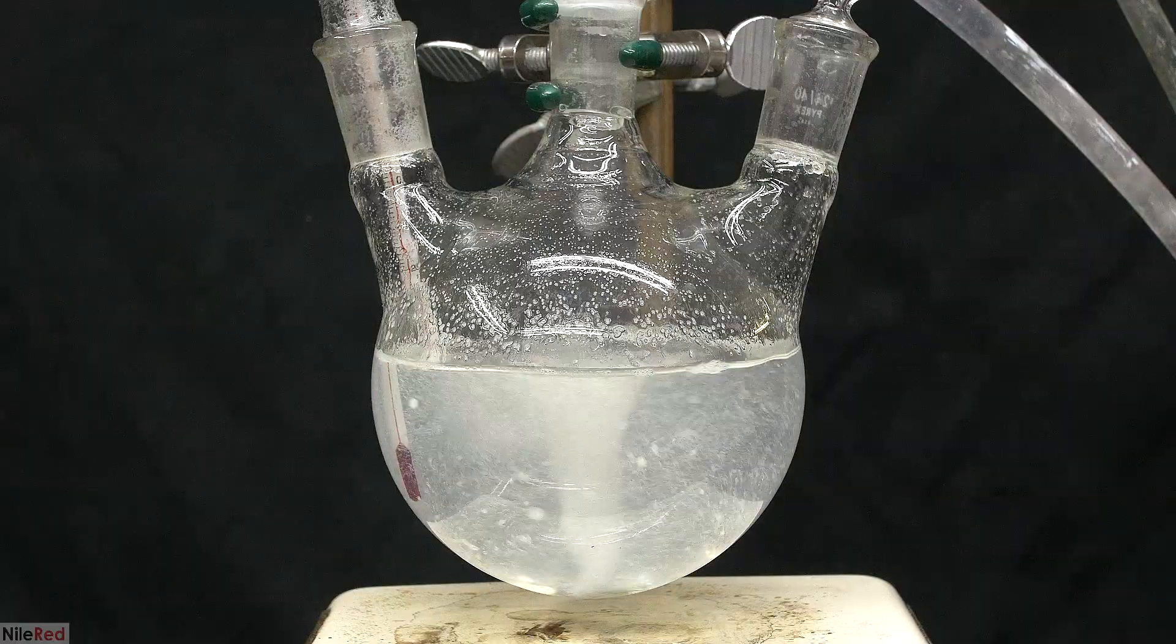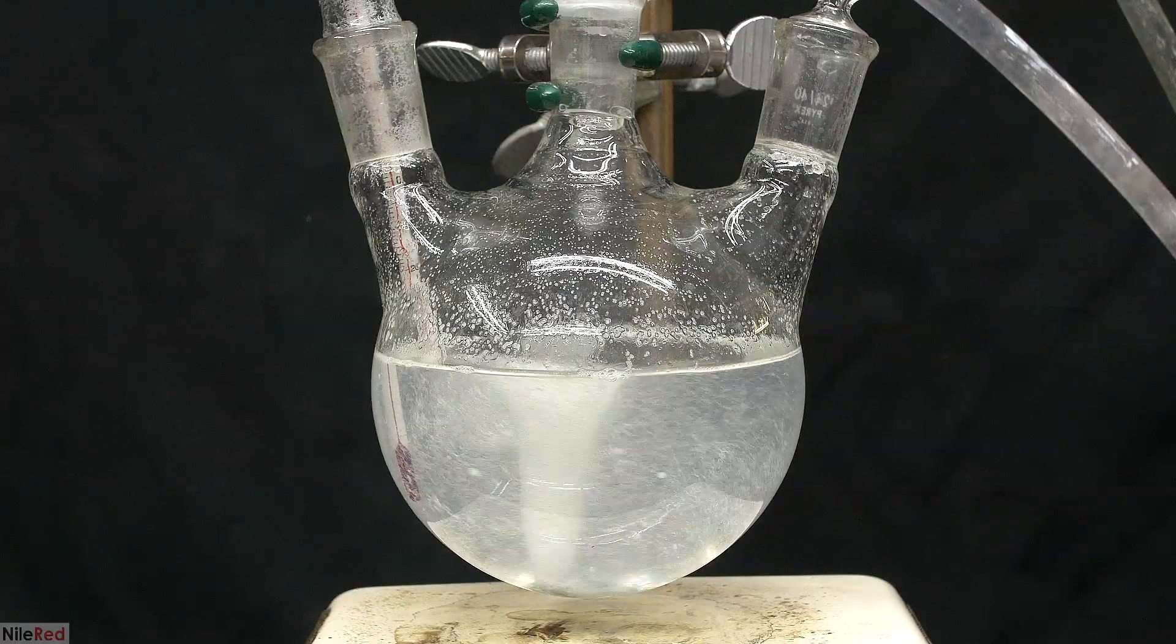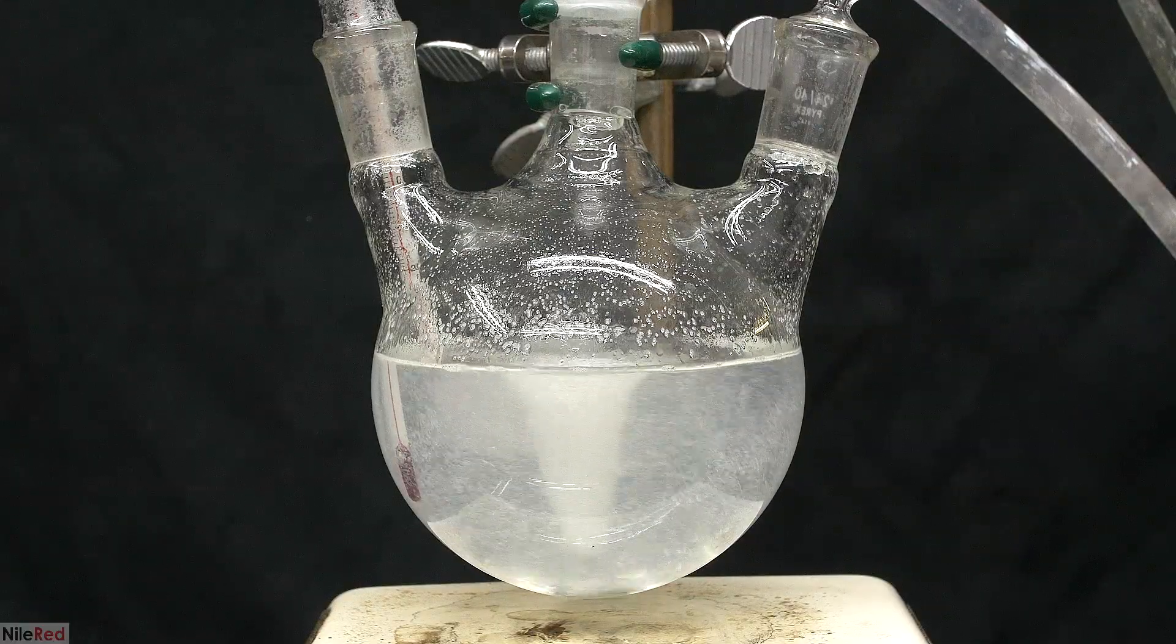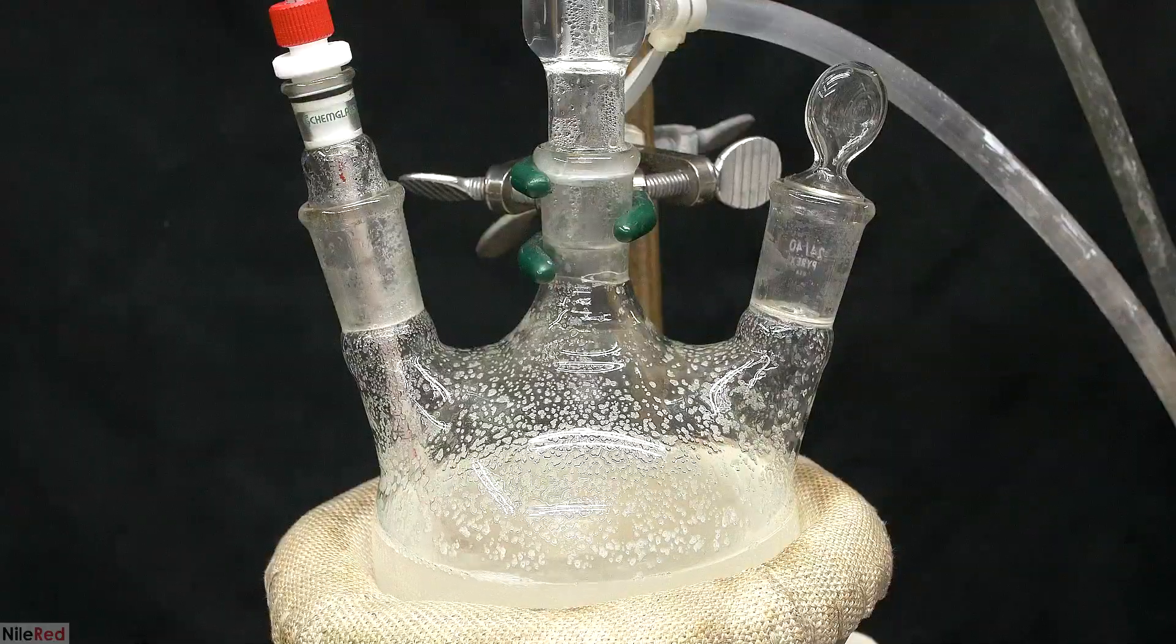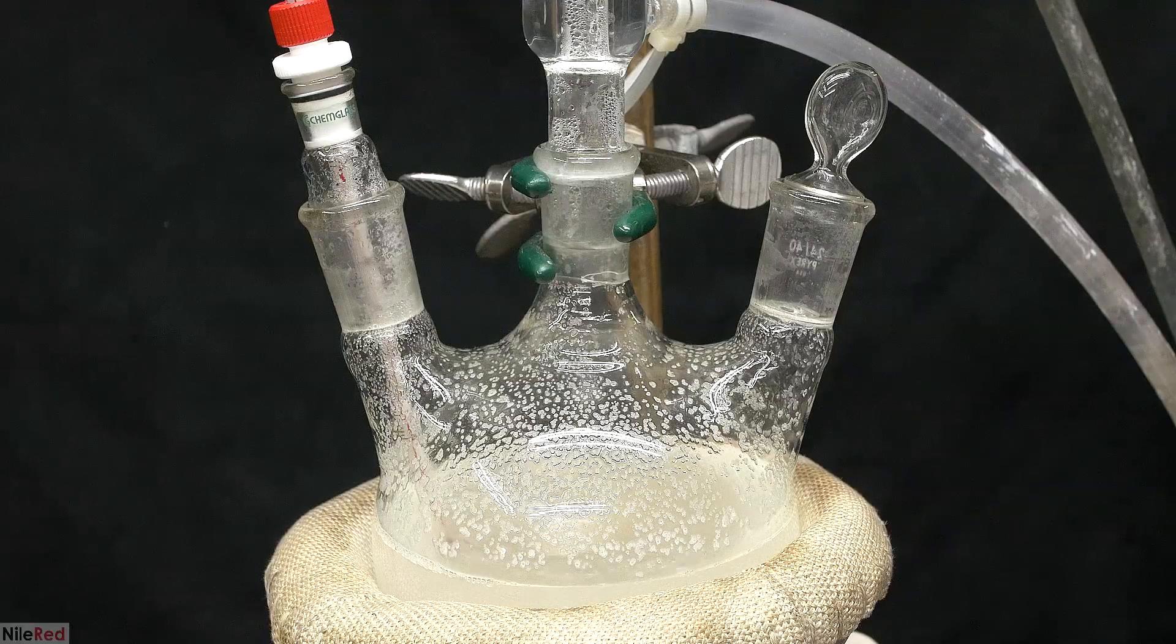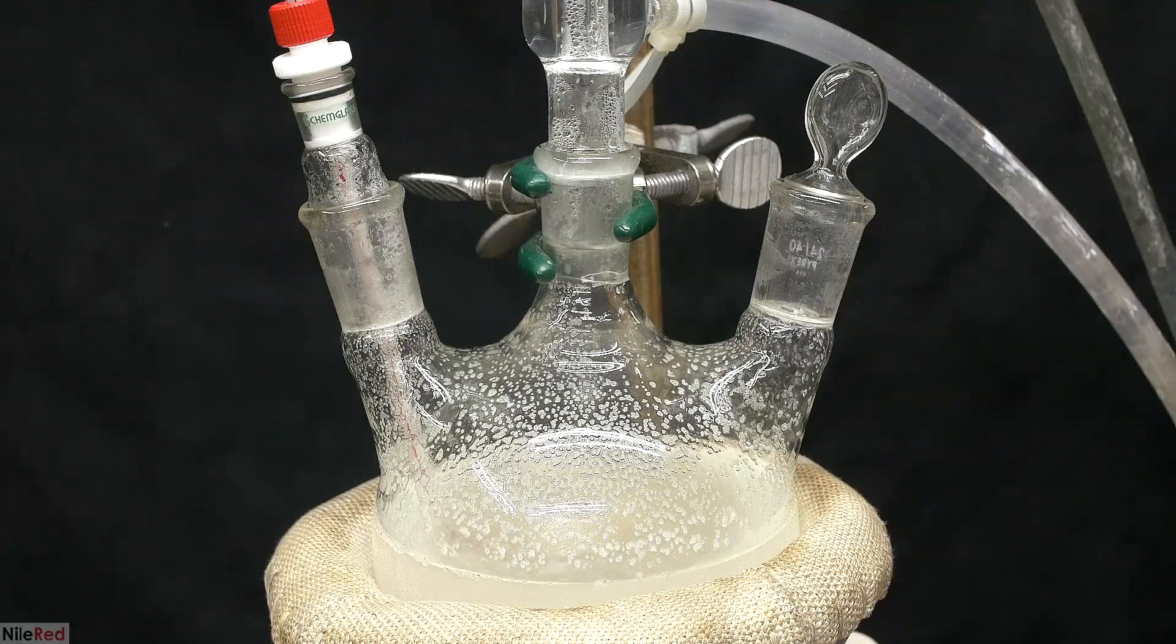I also started to see something crystallize on the sides of the flask. At first, I thought these were adipic acid crystals, but I don't think they are. Anyway, the temperature started to decrease, and I actually needed the heating mantle from this point on.